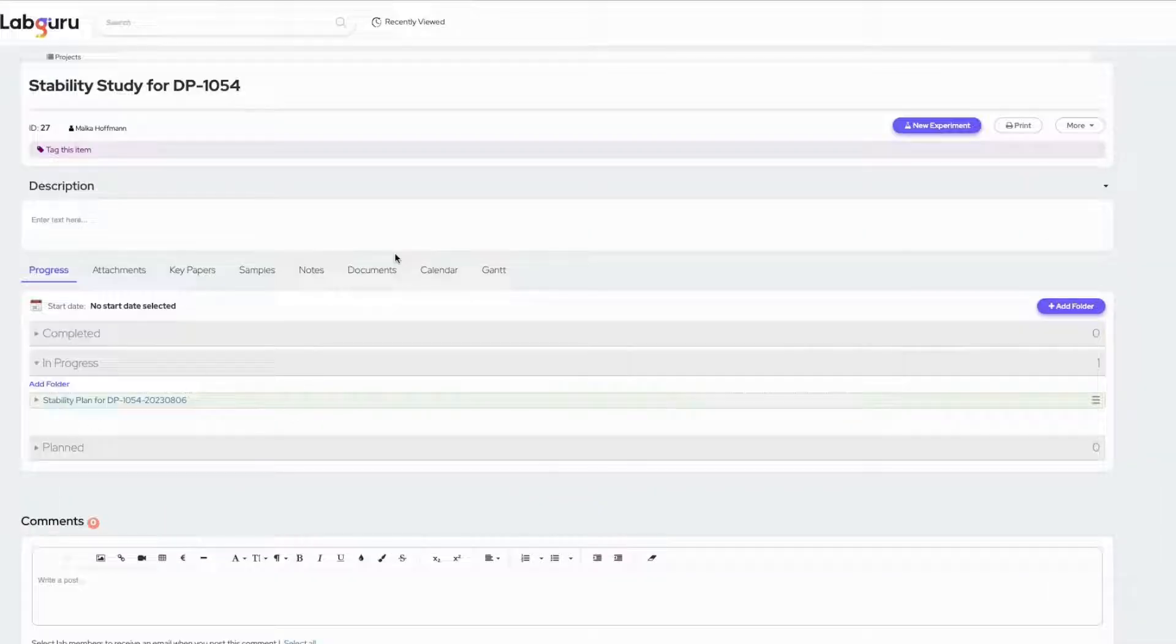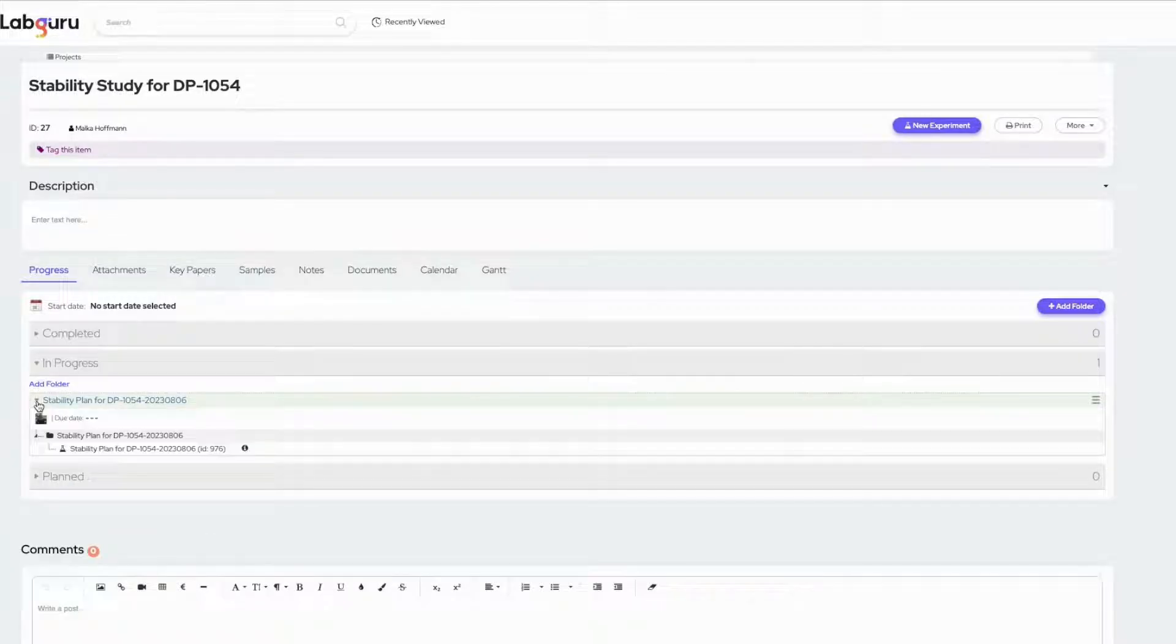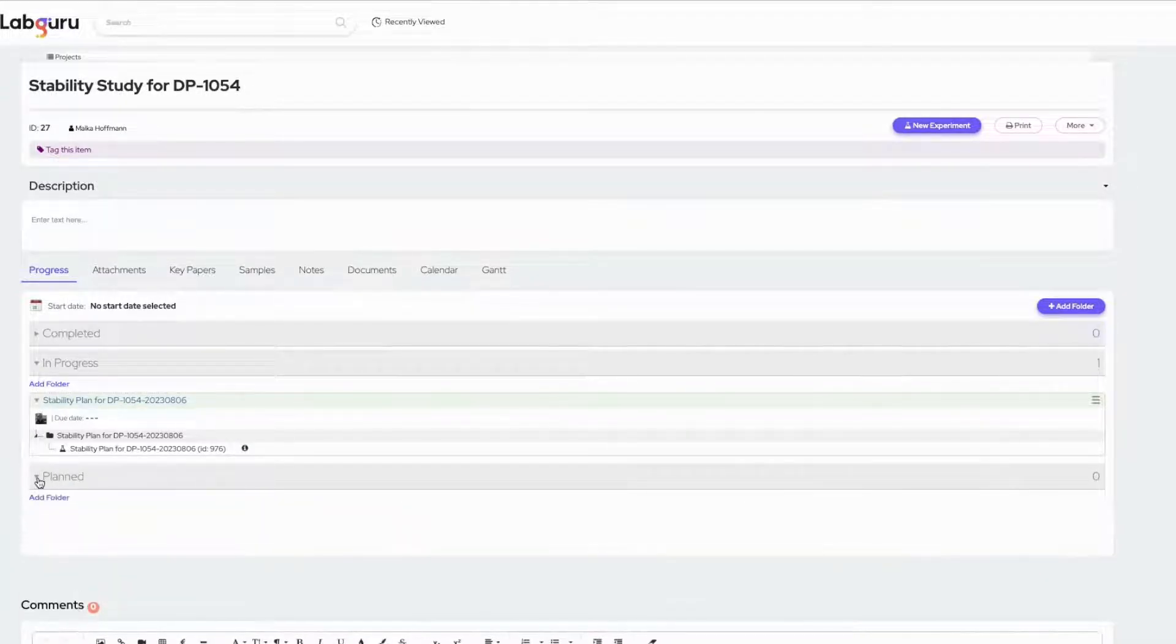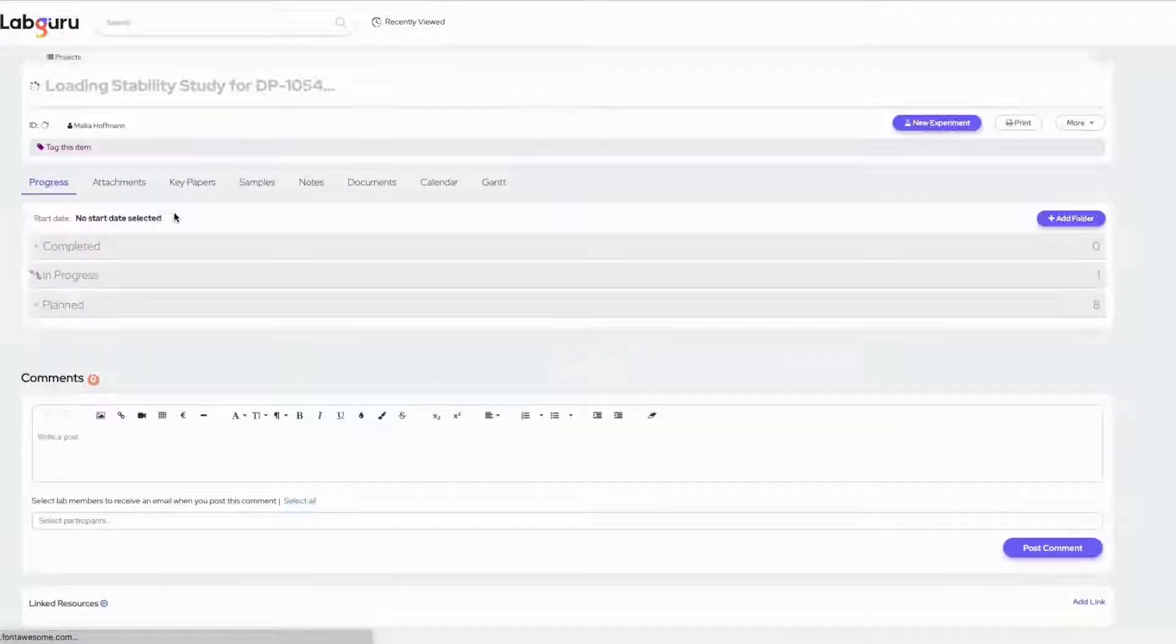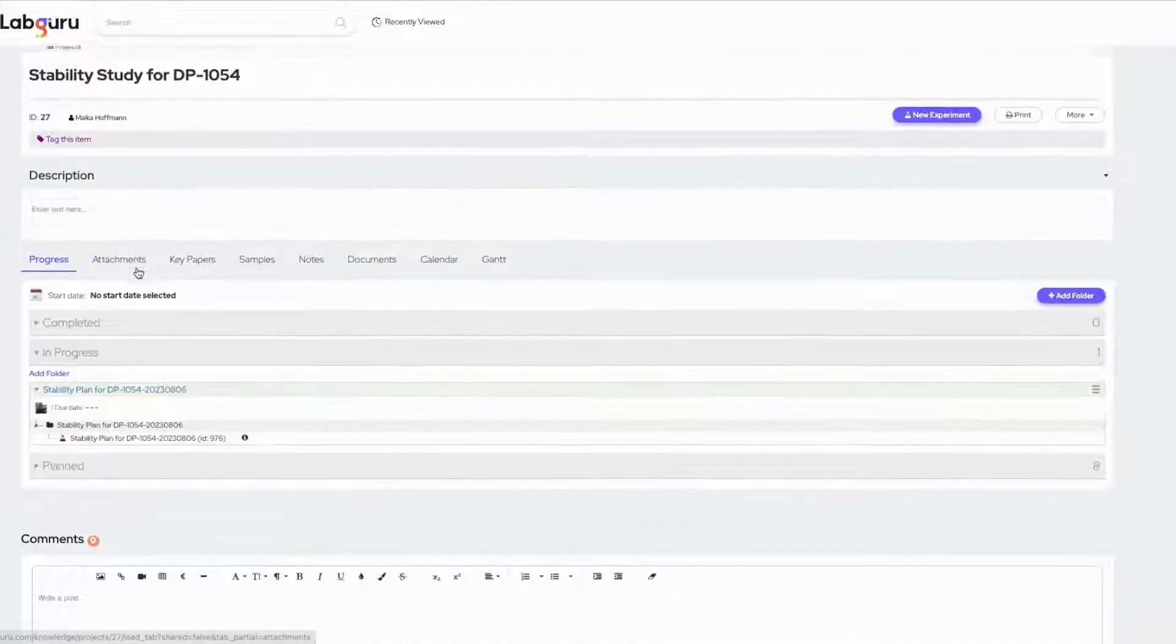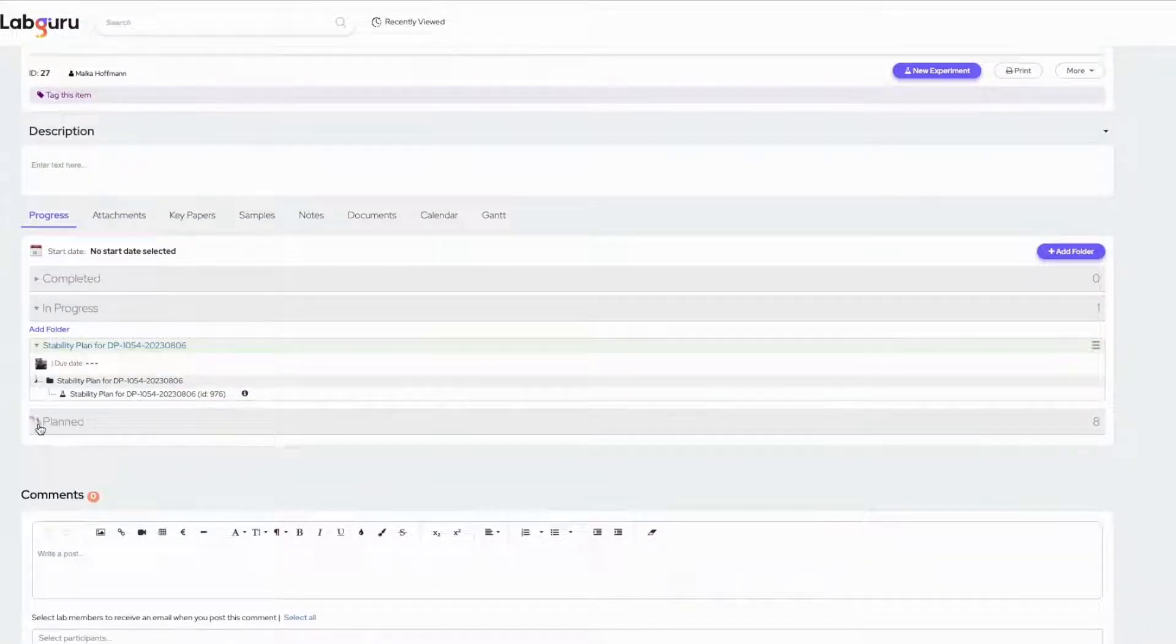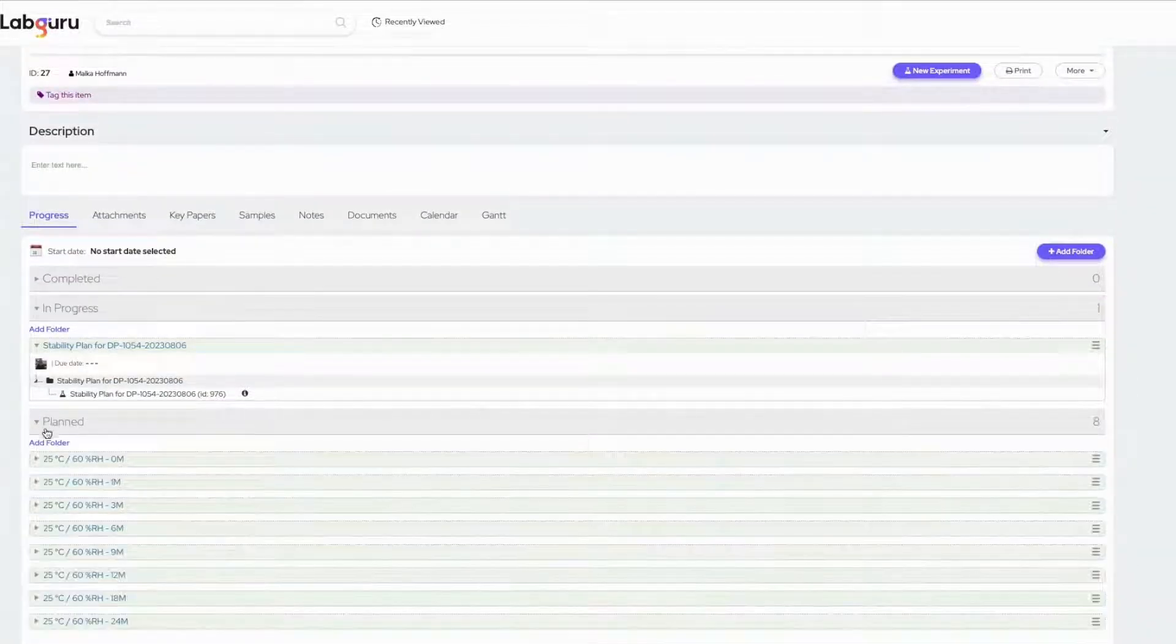Let's open the stability project where we initially saved the stability plan. Under the plan status bar, the automation will create a folder for each storage condition and time point. Let's refresh the page to see the outcome.